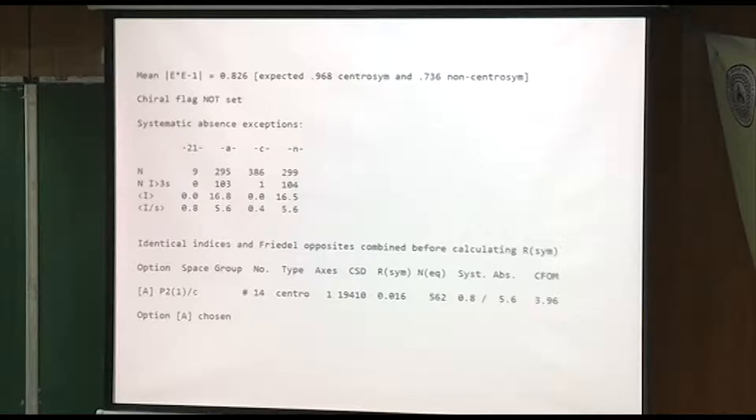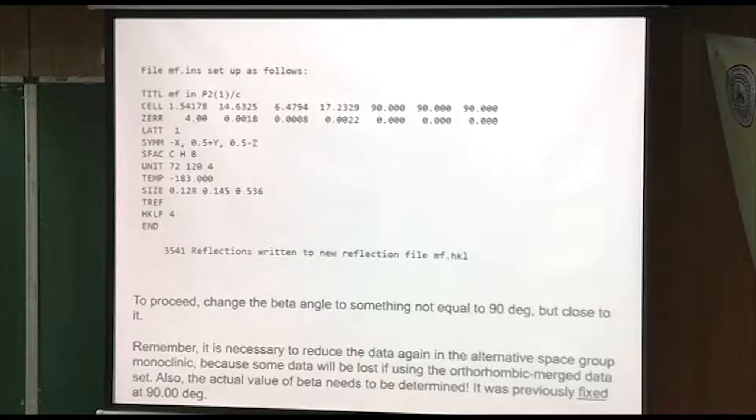It sets up this file. The main thing I wanted you to notice here is that this is now copper radiation. The wavelength is 1.54178 angstroms, about double what molybdenum wavelength is. Here's the symmetry operation, SFAC just carbon, hydrogen, and boron. I put in the size and then it's set up to do TREF, direct methods.